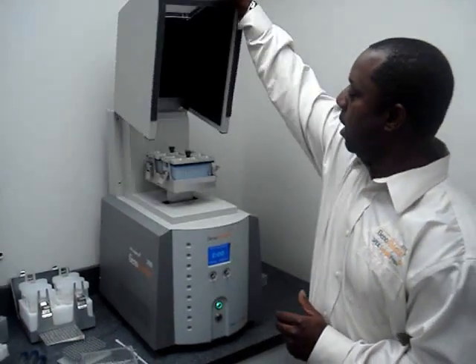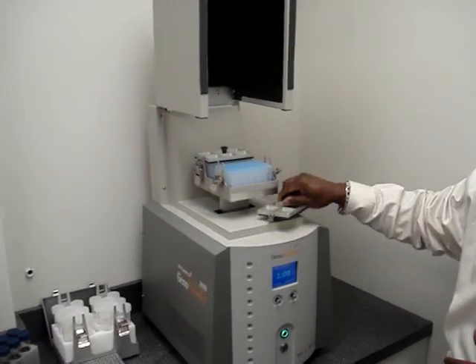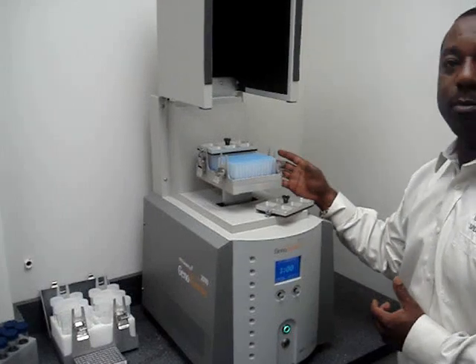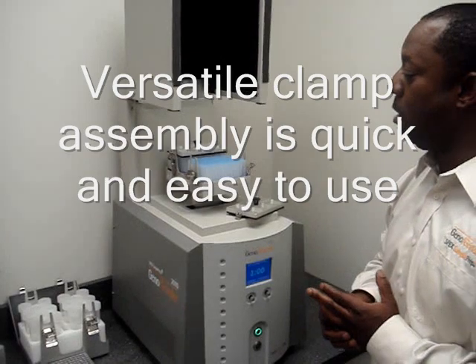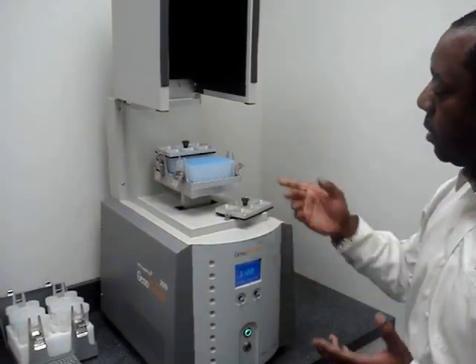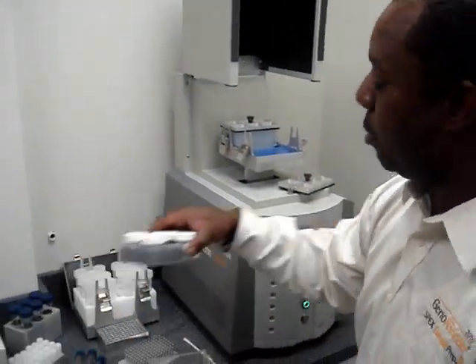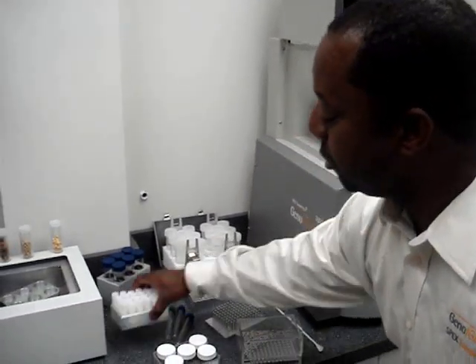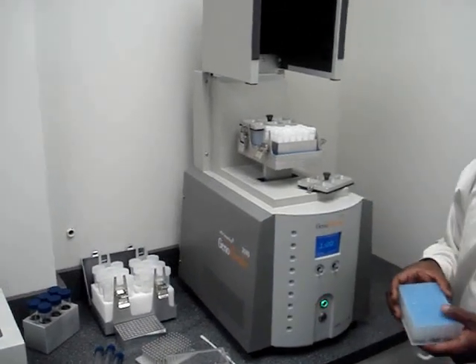First I'll show you how the Geno Grinder is originally designed for doing titer plates. The system comes with a standard clamp which allows you to do two titer plates simultaneously, and usually the disruption times are between one and two minutes. This same clamp will allow you to do different formats all the way to 15 mLs or 5 mLs, increasing throughput as you go.